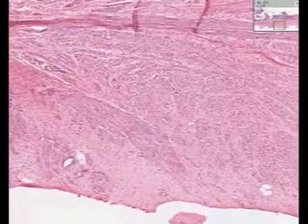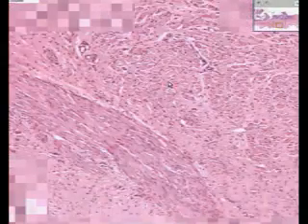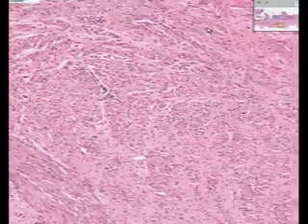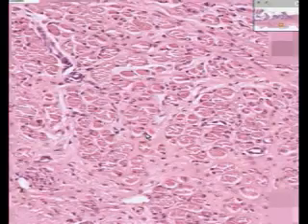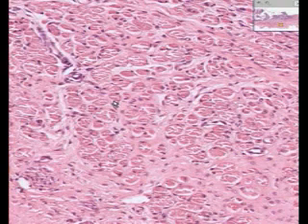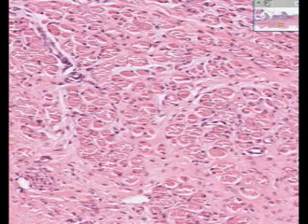And these are skeletal muscle fibers. And you know that these are skeletal muscle fibers because they have their nuclei oriented towards the periphery of the fiber, which you can see. There's not a single fiber here in which you see a nucleus in the center, they're all at the periphery. You also don't see the striations very well because they're cut in the wrong plane to see striations.